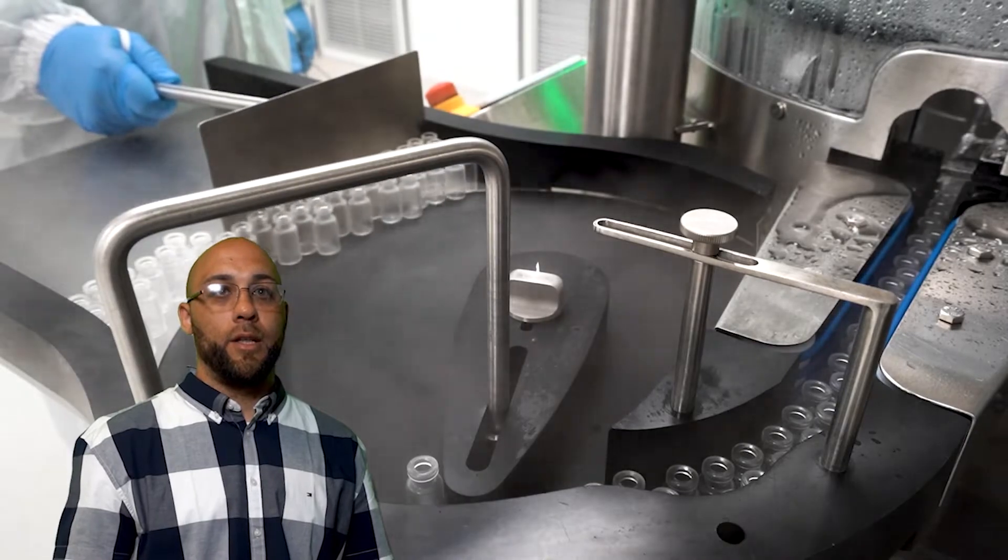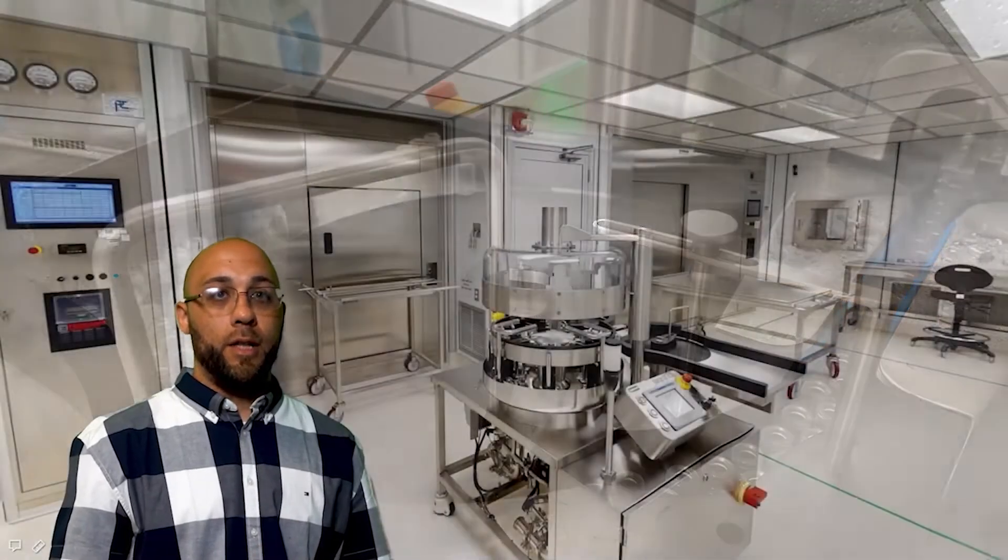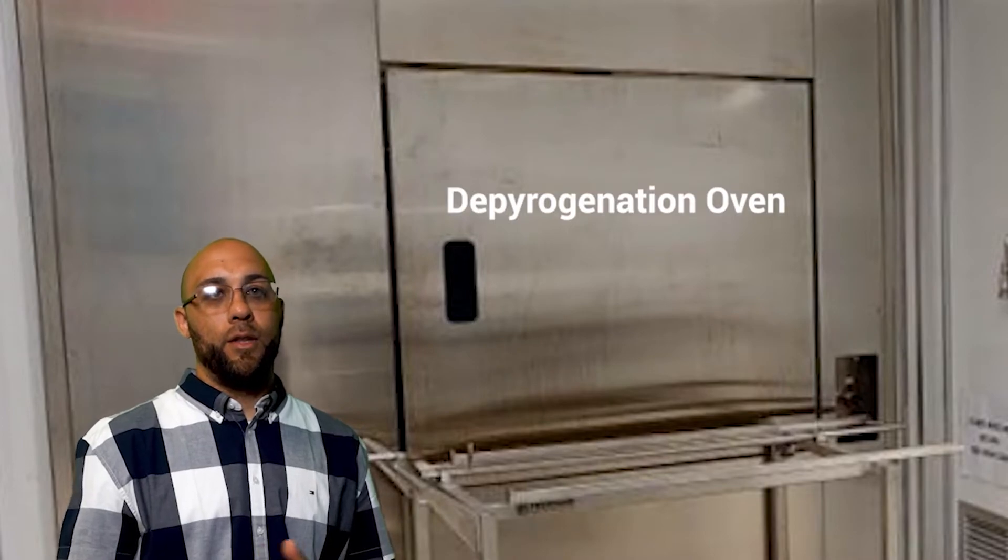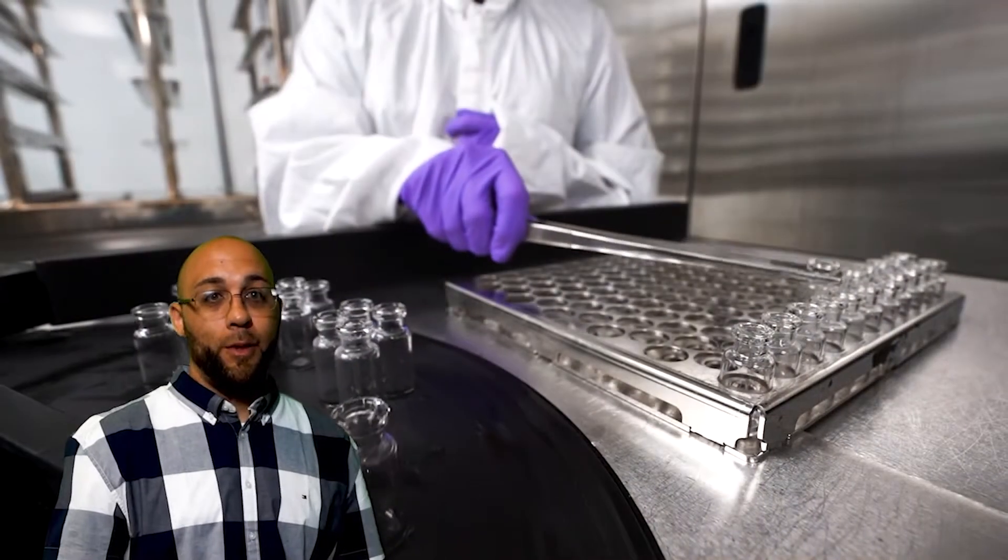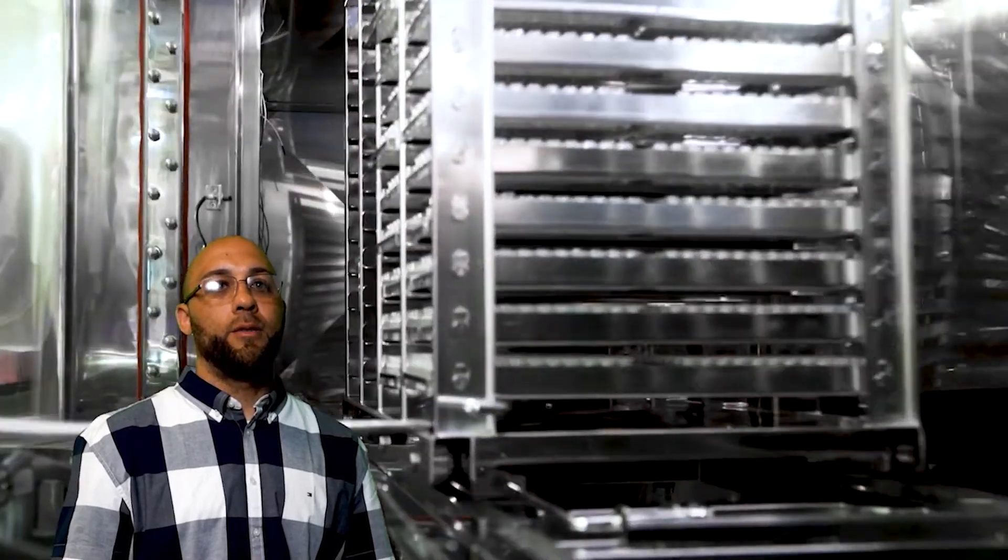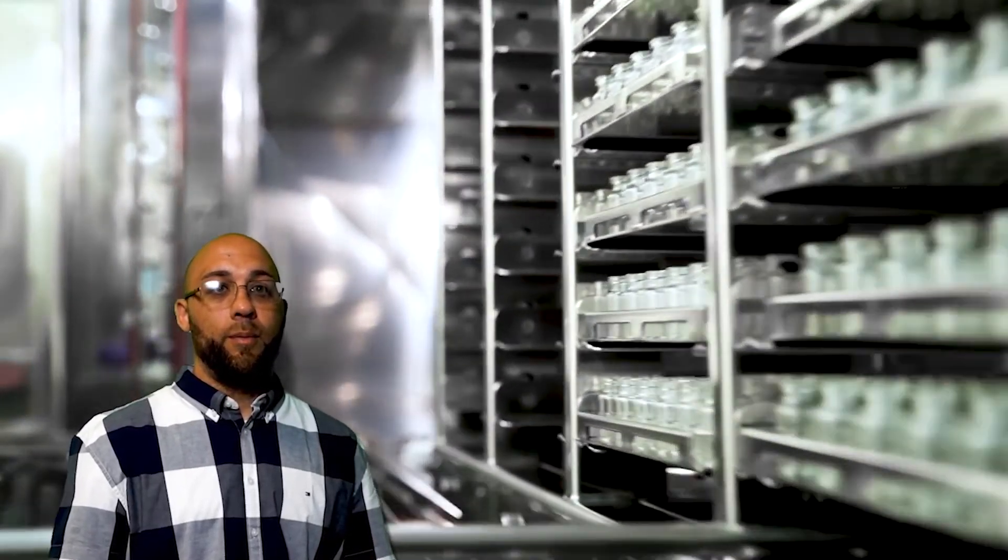We also wash and sterilize vials here. The vials enter the depyrogenation oven, which offers the same level of sterilization as the autoclave, only using dry heat. Our job is to ensure we have all the materials we need to complete the fill ready to go, so there are no delays, and to ensure that the products we make are sterile, so we can keep patients healthy.